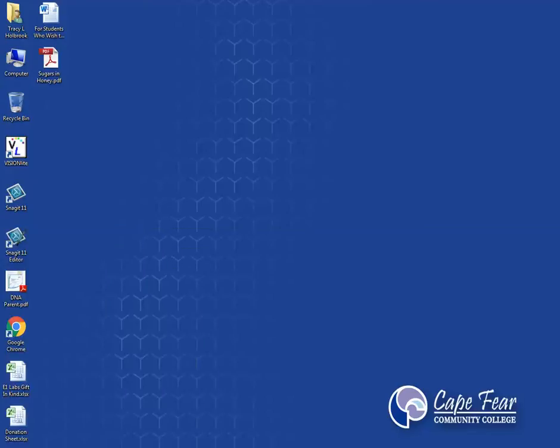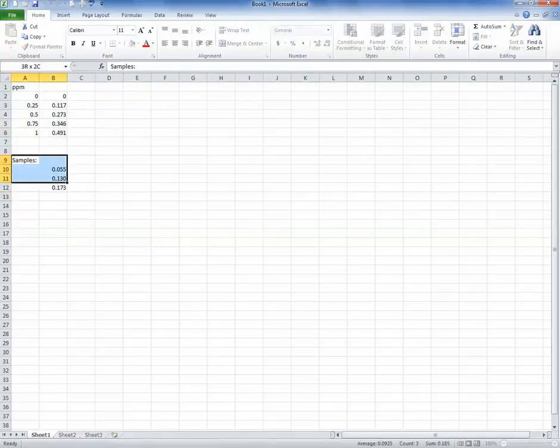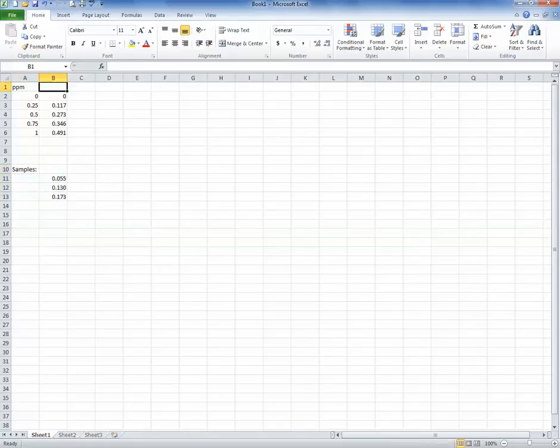Okay, so if I click Microsoft Excel, this will pop up, and what I've done beforehand is I've gone into Excel and typed in the data that I got from my laboratory analysis. When I made my samples, put the samples onto the machine, and got the absorbances, I went ahead and put that into Excel. Now, how do I do it? It's very easy. This is the data that I've entered, but I'm just going to re-enter it over here so you can see how easy that process is going to be. So you literally just click on a cell, and I can type in ppm here.